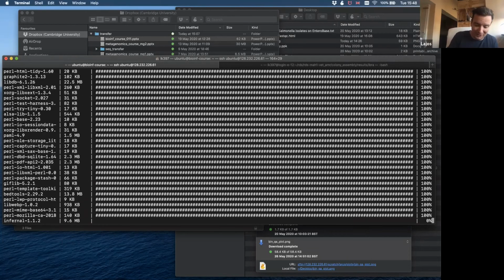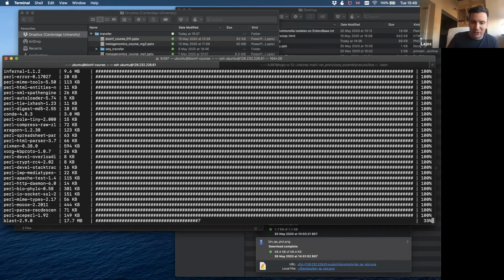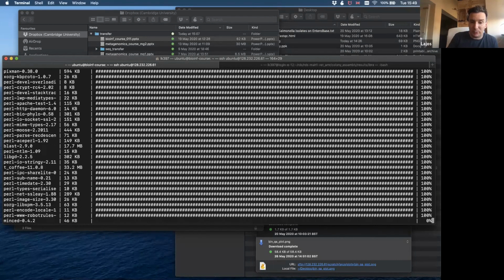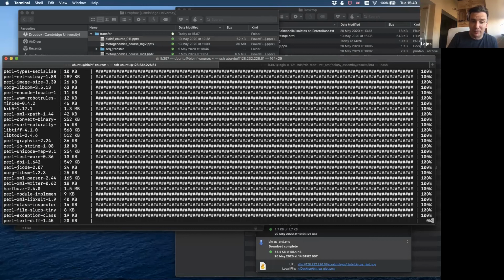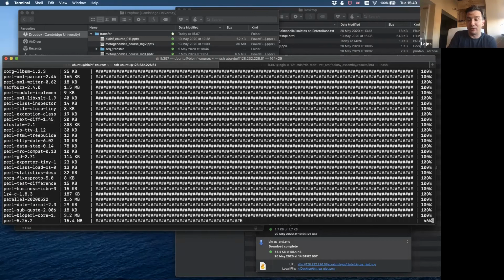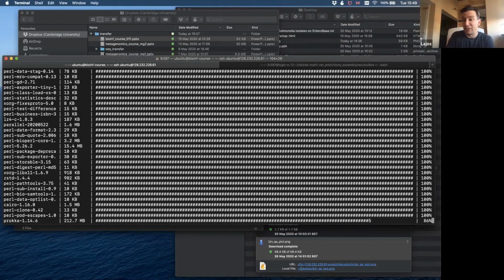Okay, so again, I'm starting the same sentence, I think, third or fourth time. The reason why you want to annotate genes, first of all, is because you are looking for specific genes in your assembly, and instead of looking for specific genes by blasting them, you are doing one gene annotation once, and from that moment you can see if that gene is there.